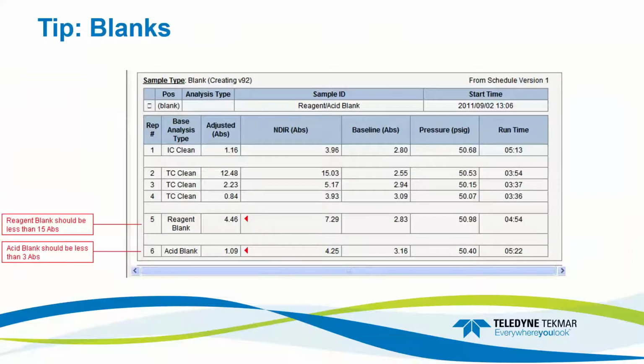So tips for blanks. When we want to look at a blank, once we have a good clean system, we want to blank the system. We want to understand what a blank is. Notice the cleaning procedure is automatically included in the blank procedure. This is done for a purpose by purifying the water before reagents are injected, so it displaces any DI water issues.